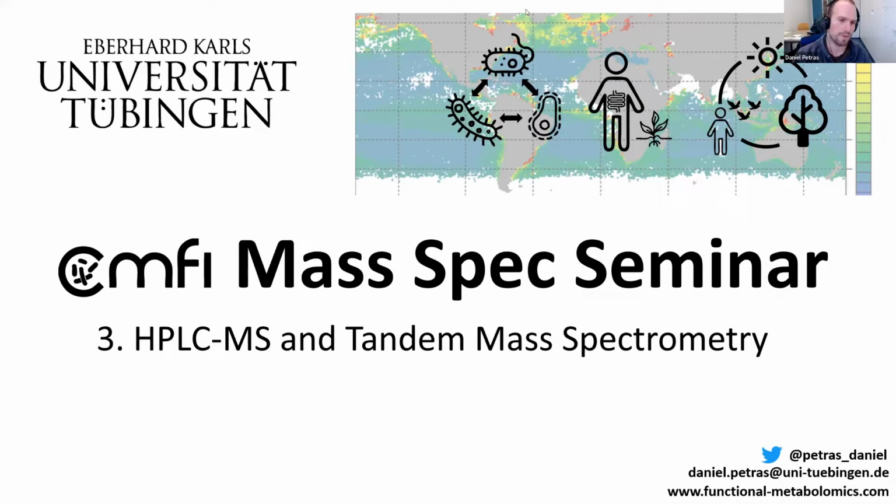So today we're going to speak about liquid chromatography and how to couple this to mass spectrometry, and then about tandem mass spectrometry. And that will also be the very fundamental basics for molecular networking, which I want to introduce briefly. And then next week, we're going to talk a little bit more about how to acquire data and how to convert this to open access formats.